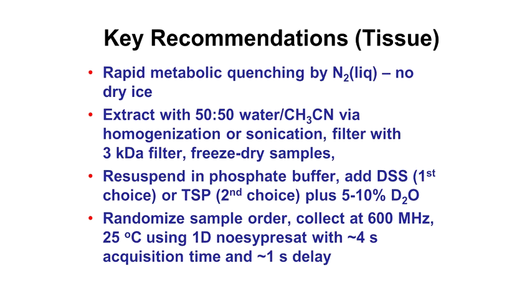The freeze drying gets rid of the acetonitrile. Of course, it'll also get rid of some of the volatiles. But it is the method that's preferred and generally recommended. And then same sort of things. Add DSS, add D2O, collect the 1D NOESY presat with the same acquisition times and the same delays.